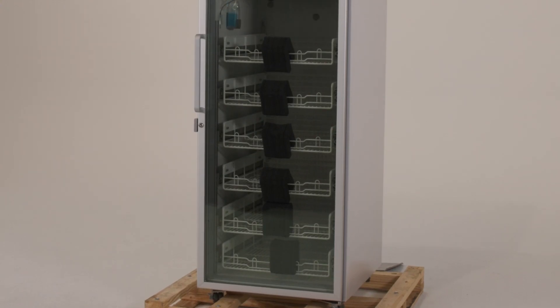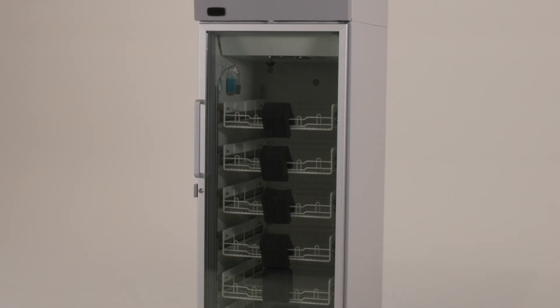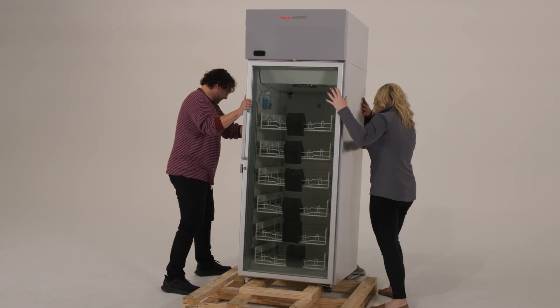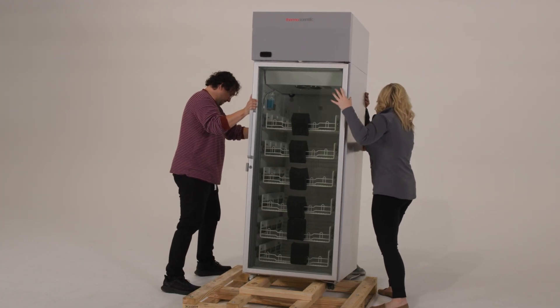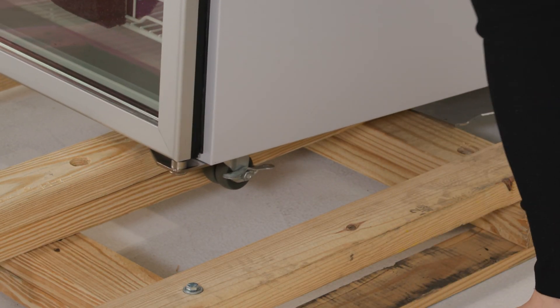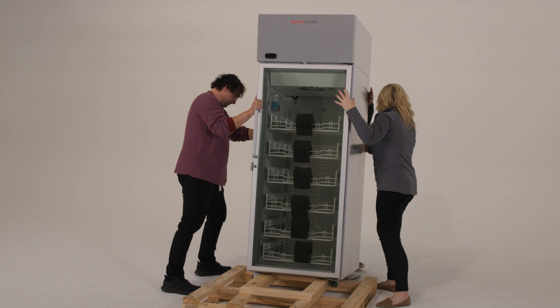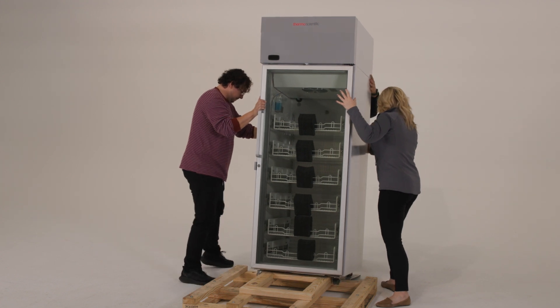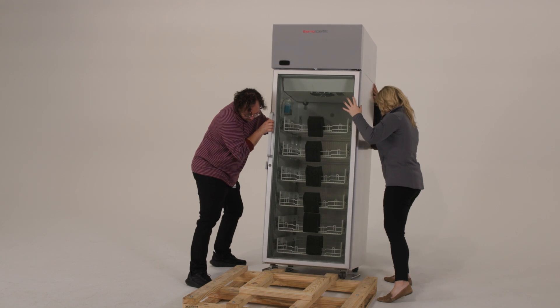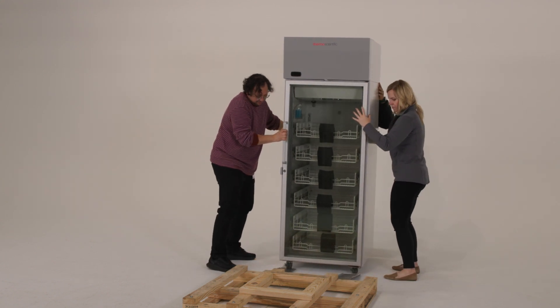For the next steps, have at least two people available to help — more people may be needed. With one person on each side of the refrigerator, slide the unit towards one side of the pallet until approximately three inches of the refrigerator overhang the pallet. While still supporting the unit, carefully slide it sideways until the casters reach the floor. Carefully roll the unit off the pallet.